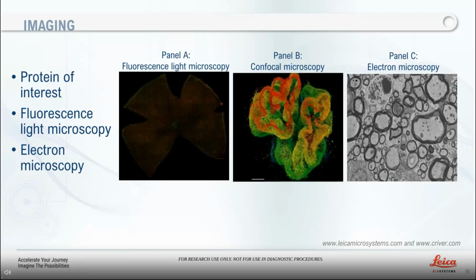Imaging is a world of possibilities. Those possibilities will depend on tissue quality. One way to proceed with imaging is to trace the fluorescently tagged protein while it moves through the cell in real time, which we call in vivo imaging and which we won't discuss in this webinar.